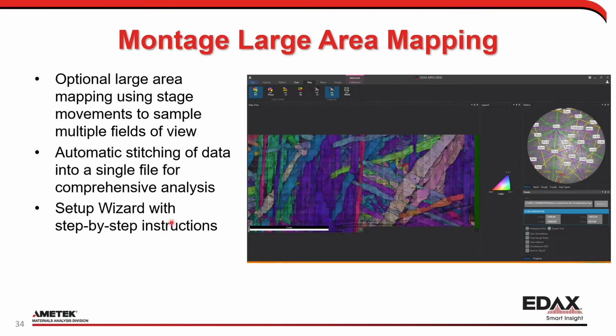There's a setup wizard that follows more step-by-step instructions. It gets around to some of the most common problems that we see with APEX. Most of those problems actually tend to be on the microscope side.